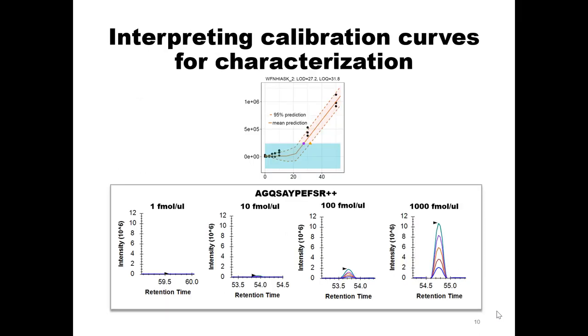So let's look at what curve data looks like. I talked about how the canonical shape of a calibration curve is this hockey stick shape. What the data looks like, if you were to look at the chromatogram, is that it should be shrinking as you decrease the concentration. And that's all these types of calibration curve figures are showing you: for different concentrations, I'm getting a decrease in the intensity or the abundance.